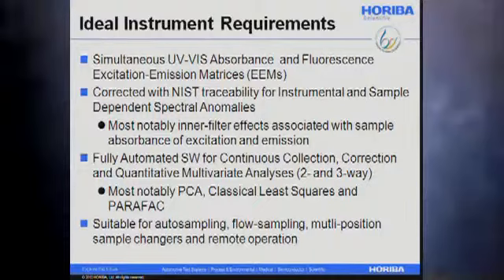In addition to that, there have been recent breakthroughs in being able to fully automate software for continuous collection, correction, and multivariate analysis using various techniques for the data analysis. And then also there are several aspects to coupling the system with auto samplers, flow sampler systems, multi-position sample changers, and remote operation.